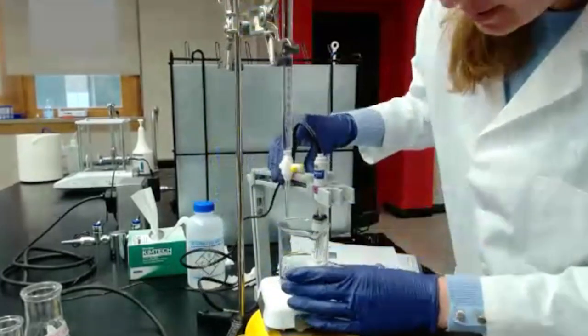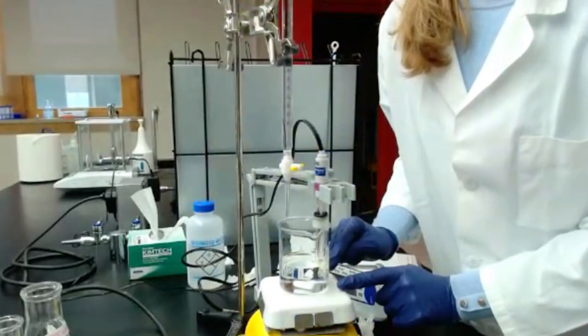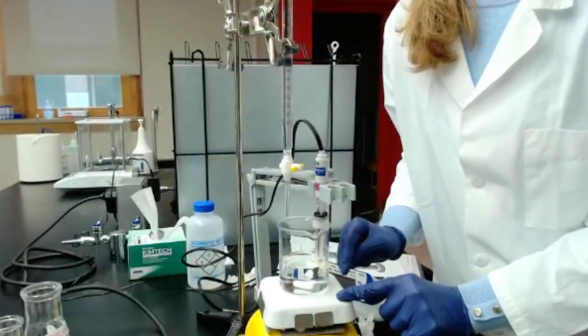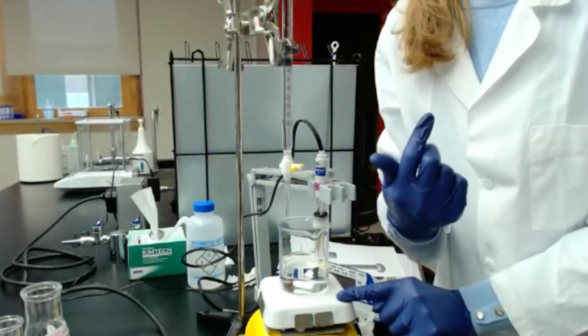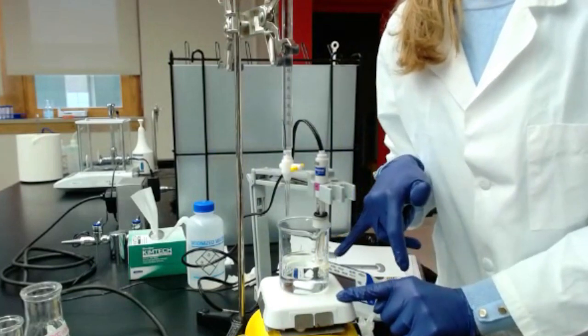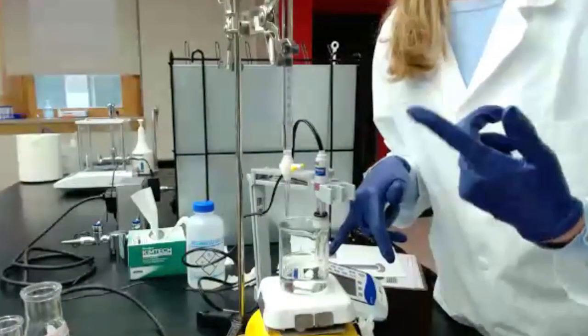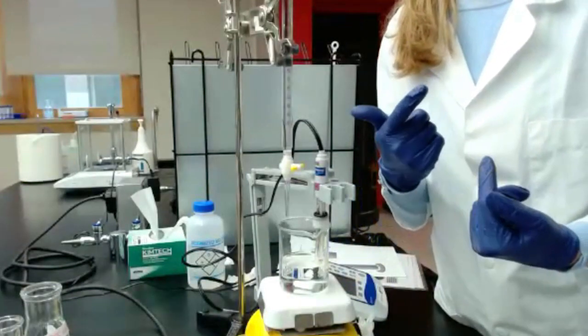Make sure the probe is in the solution but doesn't touch the stir bar, because if you start stirring, it can break. There's a piece of glass at the bottom of the probe, and if the stir bar touches it, that might break.